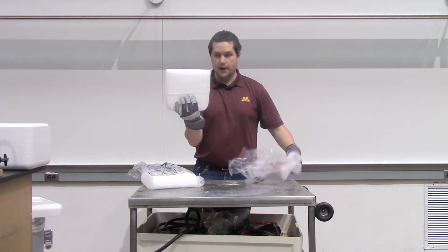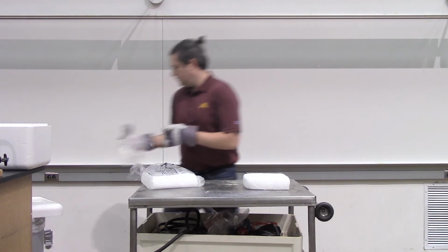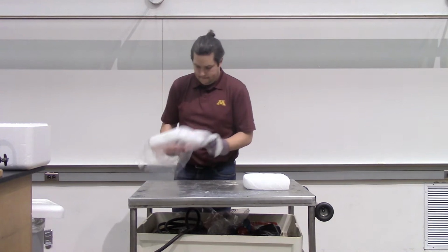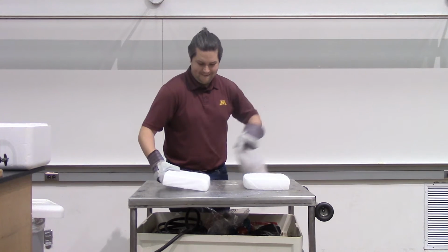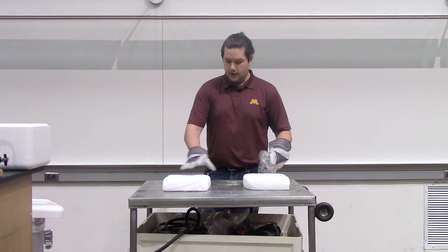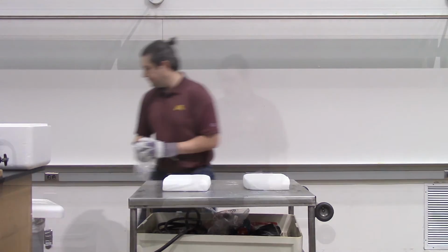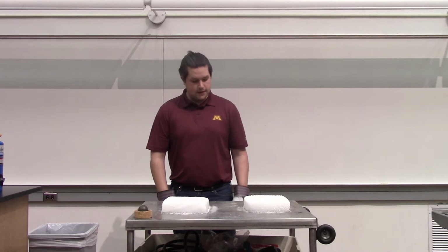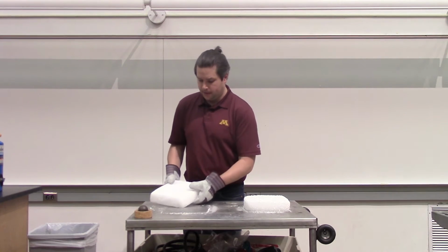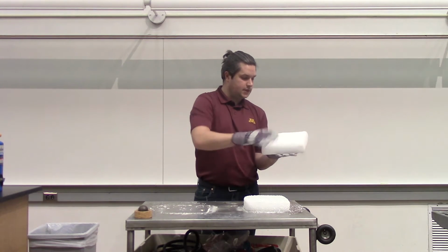So here's the block of dry ice. And by letting these sit here for 15 to 30 minutes, these surfaces that are actually quite rough will smooth out. Okay, a little while has passed. These are starting to get very flat on the side in contact with the cart. They've also got a lot of water condensed out of the air on top.